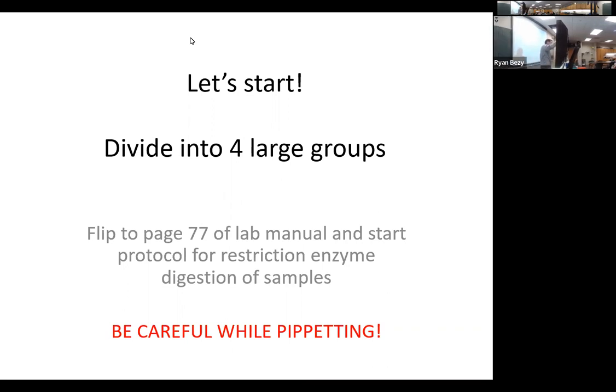Does that make sense, everybody? If you're not sure, show me. You're pipetting very tiny bits of liquid this time around. And a lot of the earlier lab sections ran out of their enzymes and stuff like that. So it's very tiny, very small presses that are going to be involved here. Questions? All right, go ahead and get going.